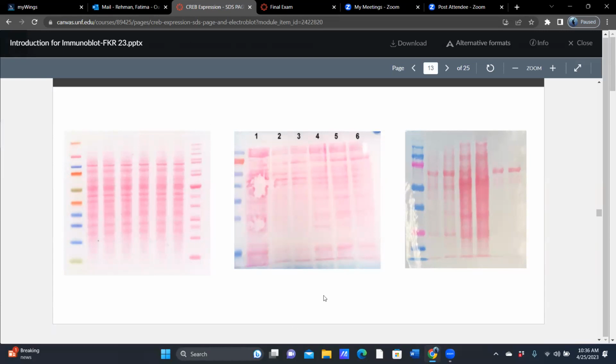Great blot. Here is another blot, more like what you would see generally. The first one is very hard to get, unless you are very experienced. Here is one where most of them are relatively equal, right? You still see some of them are a little bit lower, a couple of them are a little bit higher. This one seems a little bit higher than all the others. So this one will need some playing around to make some conclusions. More importantly, look, there are a couple of bubbles in one of the lanes.